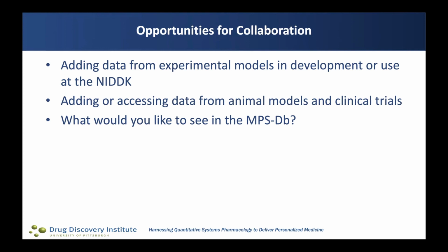As I tried to portray in this presentation, we've worked hard on developing a streamlined approach to getting data into the database and creating studies. So we train individuals on that, and then they upload the data themselves.